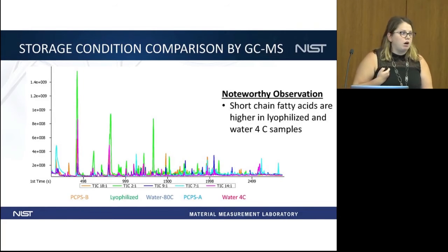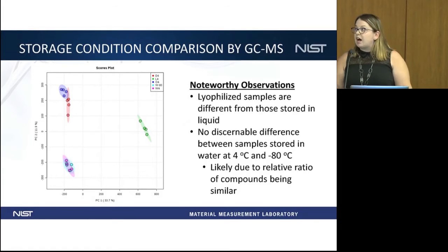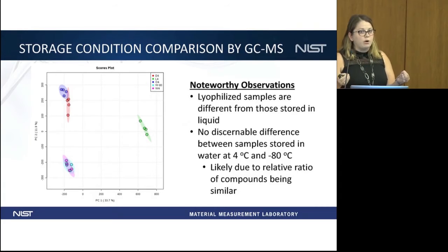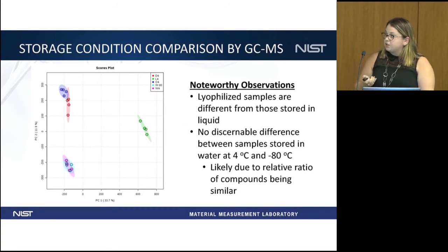When we compare across our 4 different preservation conditions, you can see that it's kind of a modge podge. Everything looks very different, indicating that the different preservation techniques result in different metabolic profiles. And one thing that comes off really surprising to us is the signal in the lyophilized samples is still the highest amongst all of them. What we think is happening in this case is the fact that the lyophilized material is kind of powdered, so there is greater surface area for the desorption of the compounds to happen, as opposed to the liquid samples, which have a more limited surface area scope.